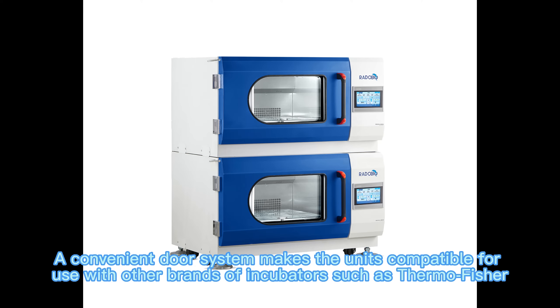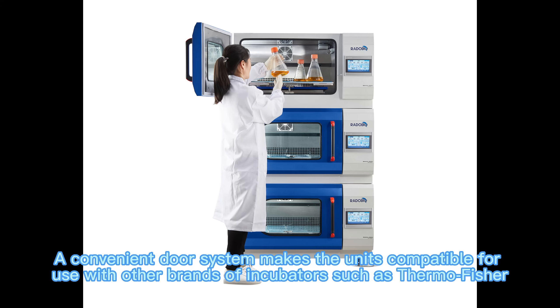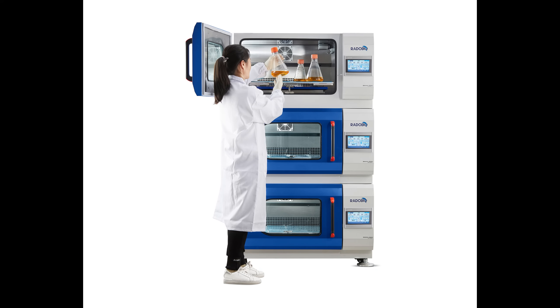A convenient door system makes the units compatible for use with other brands of incubators such as Thermo Fisher, Infors, and Kooner.